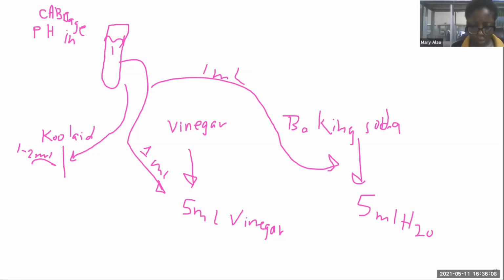So what should happen to my yellow strip? What color should show me acid and not acidic? That's what I'm trying to get put up there, but I haven't been able to because we've been talking. Okay, the indicator's up there now, so you'll be able to see what it looks like.